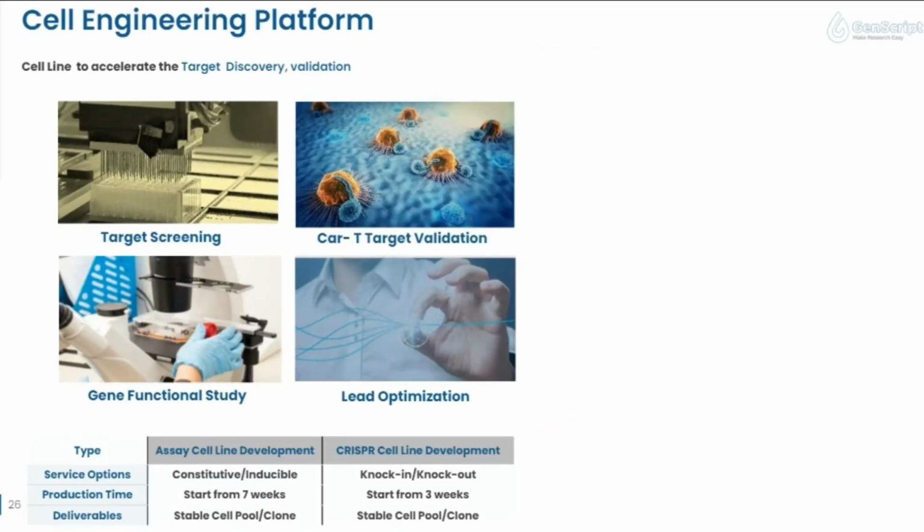Cellular assay, also known as a stable assay, serves as a valuable tool in biomedical research and drug discovery screening. It supports efficient quantification of cytotoxicity, biological activity, biochemical mechanism, and off-target interaction studies.